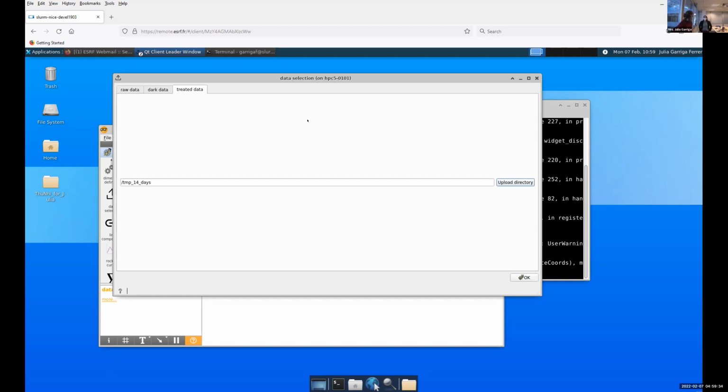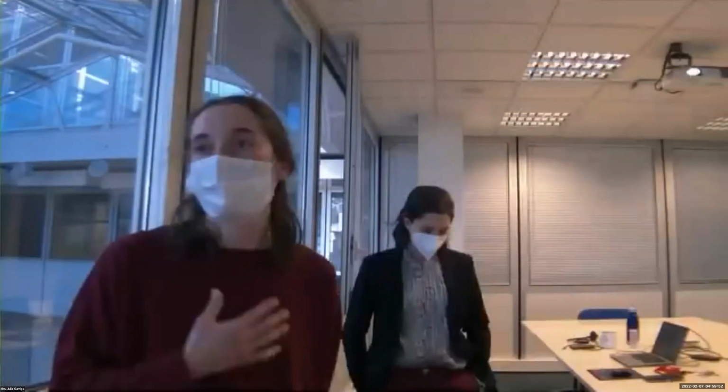Maybe just redo the pip install Darfix. If you want to share your screen, we can do it together and try to help you from here, see if we can manage to get that tab. I'll stop sharing for now. It is good, because if anyone has the same problem, we can then also help them with how we do it with you.